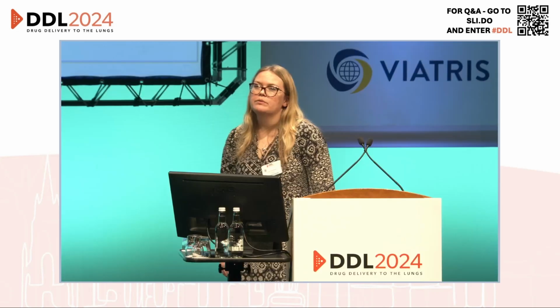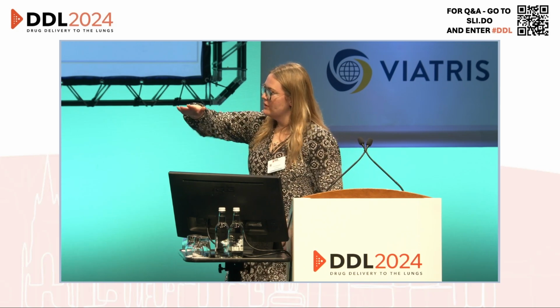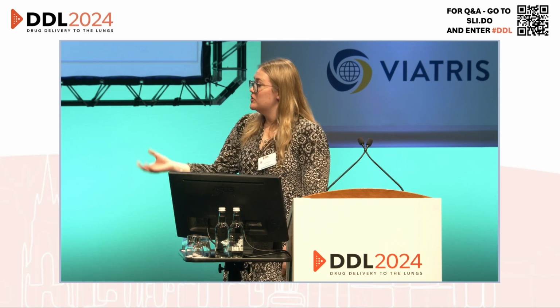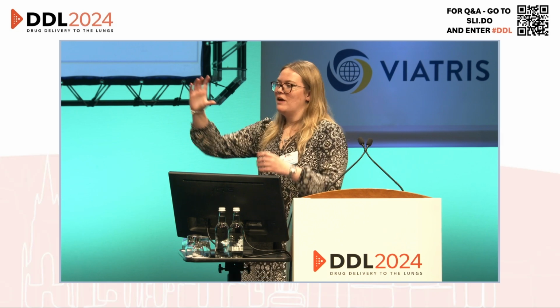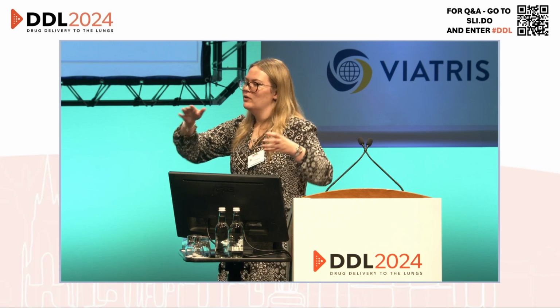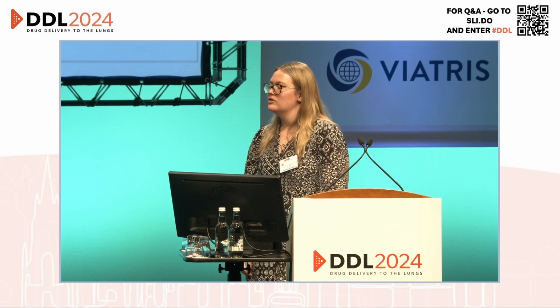Yeah, so at room temperature, especially once I disconnect all of the blocks, because it's already formed the film and there's such a small quantity, it only takes about 10 minutes once it's reached room temperature to set in place, which is really good. You don't want to be waiting around for ages for the thing to gel. Obviously, if you have a bulk amount of the mucus, it will take longer, but because I'm pouring it in as a liquid, then disassembling the blocks, it's such a small amount lining the cast that it's not taking very long at all.